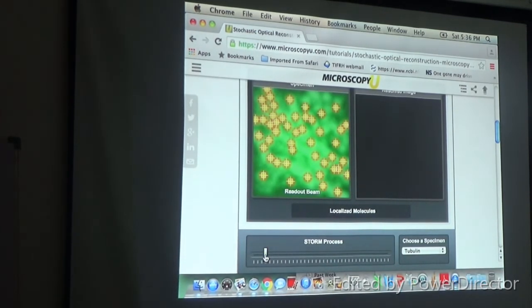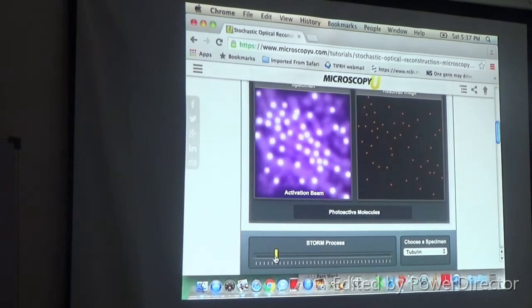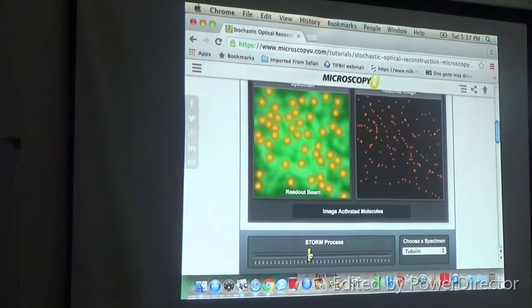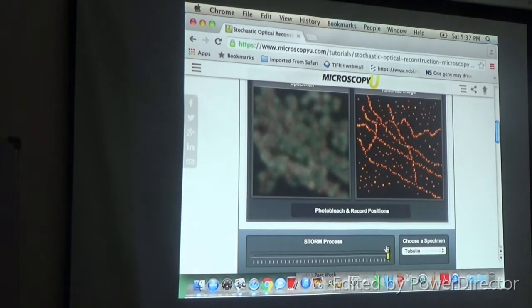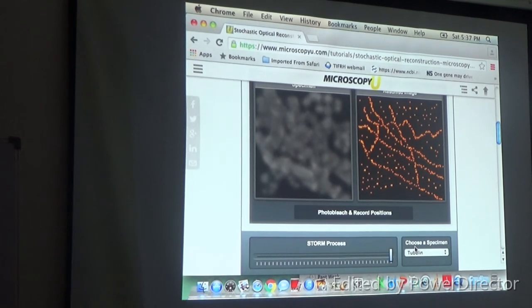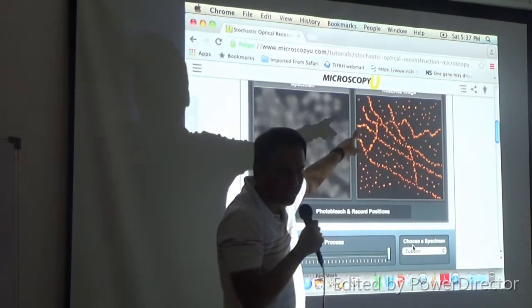So once we get the positions of each of them out, we will put some dots in our image, right? Now we will do this again and read out and localize, and read out and localize, and read out and localize. You do it a number of times, right? At the end, what are you seeing? What are you seeing here when you have read out all these positions?